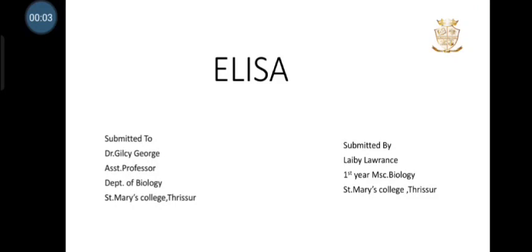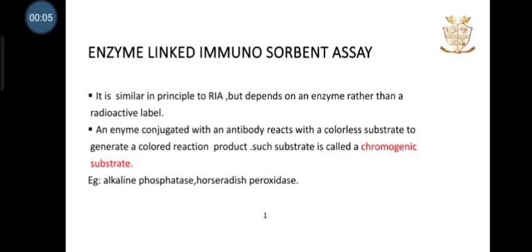Hi everyone, today we discuss the topic ELISA, enzyme-linked immunosorbent assay. It is similar in principle to RIA but depends on an enzyme rather than a radioactive label.